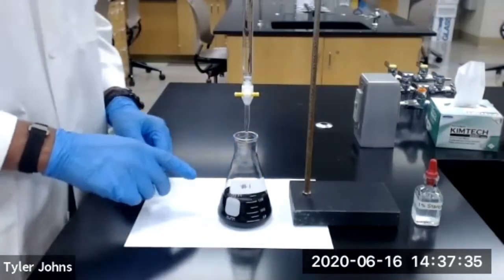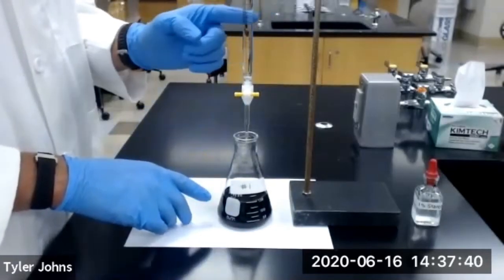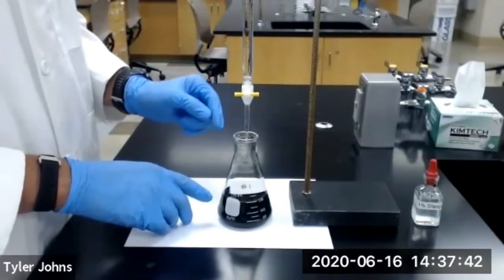We're now going to continue our titration, adding sodium thiosulfate solution from the burette until we reach the endpoint.